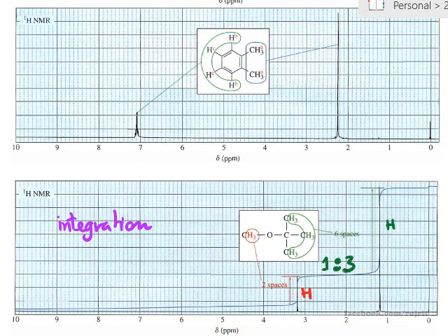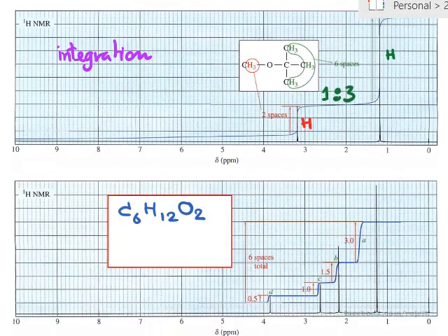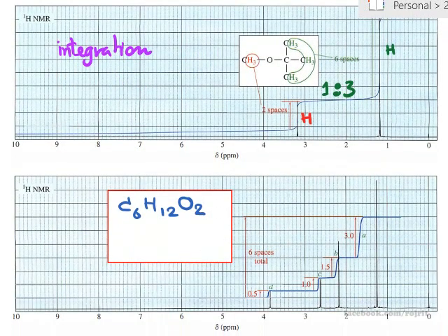Okay. So the integration here can give you some hint about the number of hydrogen atoms in the molecule, the ratio. So you can have the ratio from the integration, and you can have a kind of environment from the ppm, right? So NMR normally gives you these two very valuable data that you can use in order to interpret the structure afterward.